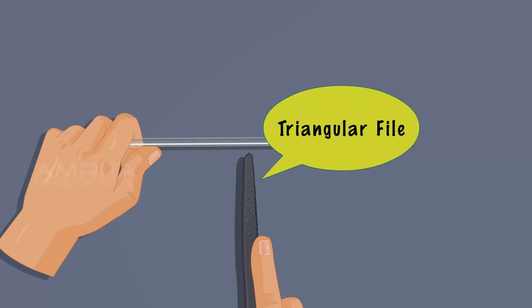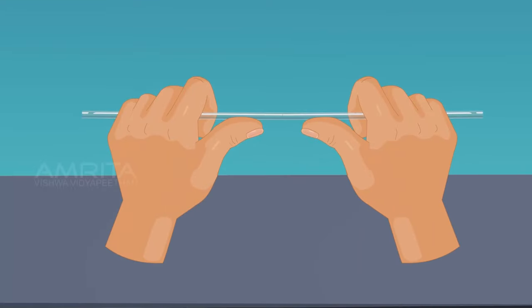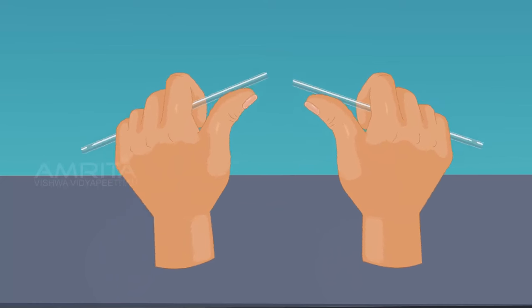Hold it firmly and make a single deep scratch with a triangular file. Place the thumbs on each side of the scratch at equal distances from it and with pressure give a quick bending motion until it breaks smoothly. Thus, we got two tubes from a single tube.